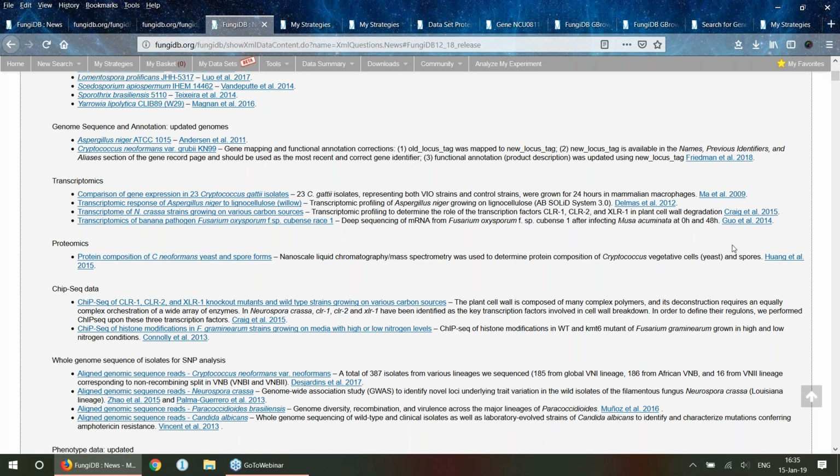So looking at gene expression at the proteome level can be quite useful when trying to understand the processes that occur when fungi respond to different stimuli, such as different types of environments. This particular proteome was extracted from Cryptococcus neoformans, which is a human pathogen. And I'll walk you through how to set up a proteomic search using this data set.